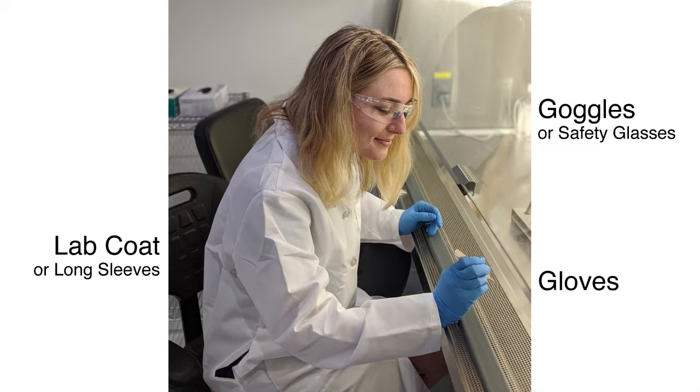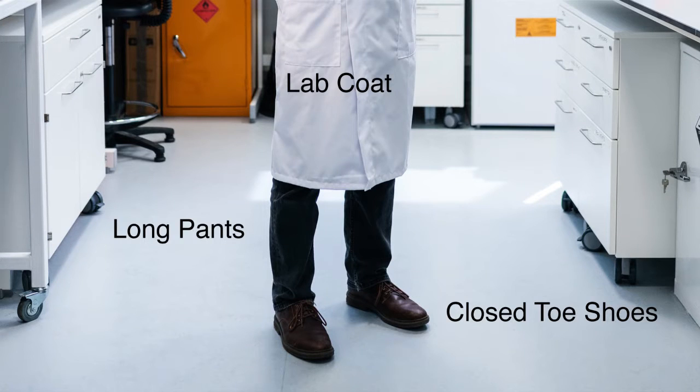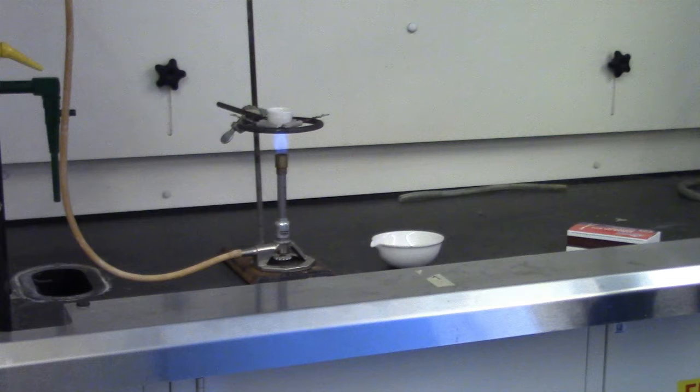Safety glasses or goggles, lab coat or apron, gloves, and closed-toed shoes are required. Long hair should be in a ponytail to keep away from the Bunsen burner. All heating of the copper and sulfur mixtures will be carried out in the hood, where there are iron rings, clay triangles, ring stands, and Bunsen burners set up for use.